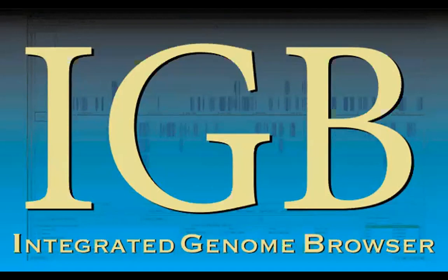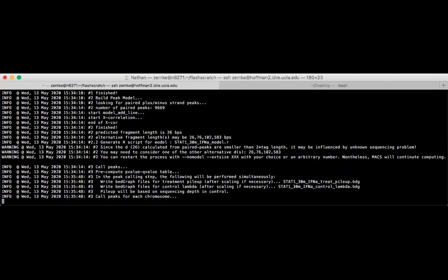Oh, and in case you missed it before, I started running the other MACS2 peak calling for the 30-minute interferon alpha treatment, which is the second command found on slide 52. So that's running right now while we're using IGB.